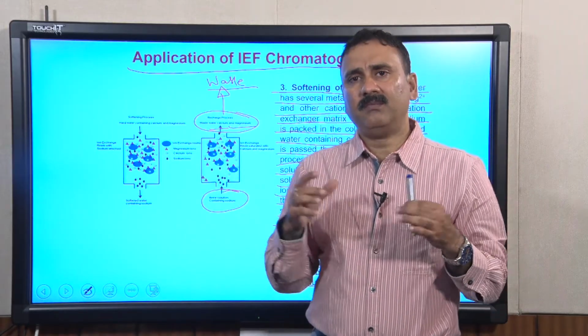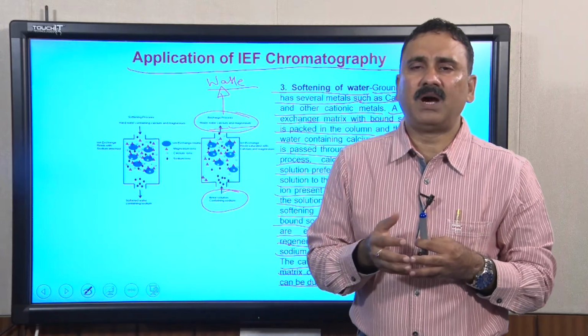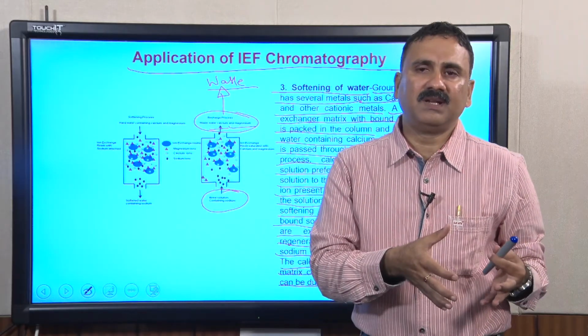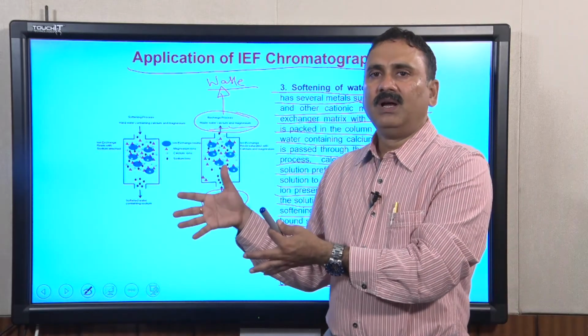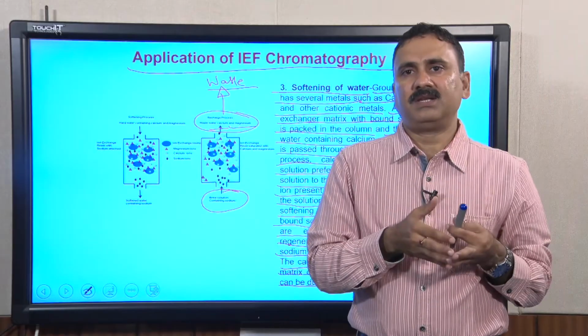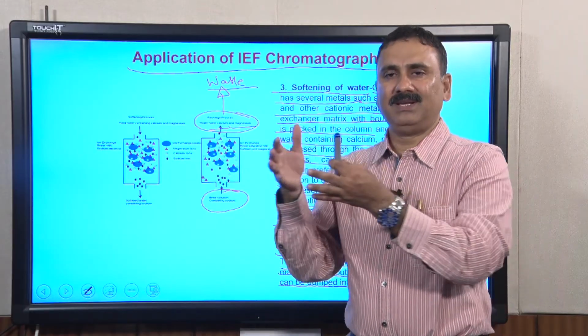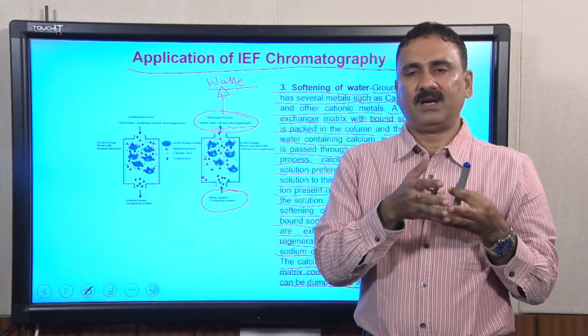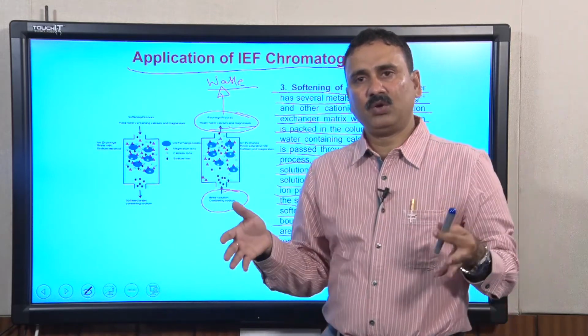So, very briefly we have discussed the application of ion exchange chromatography in protein purification as well as other applications, so that you can use ion exchange chromatography for developing different types of assays, or you can use it for studying the interaction between biomolecules.